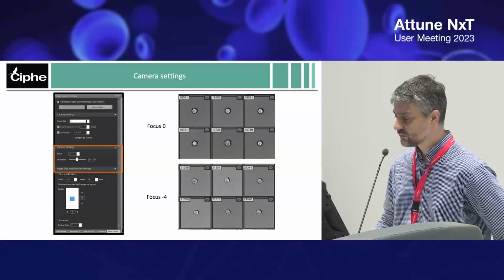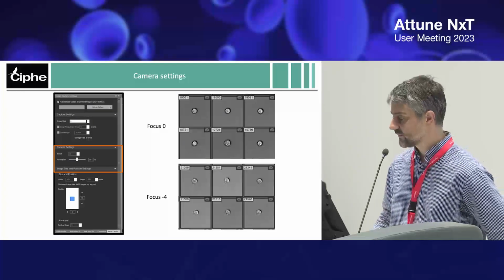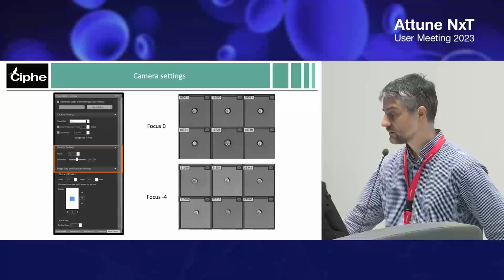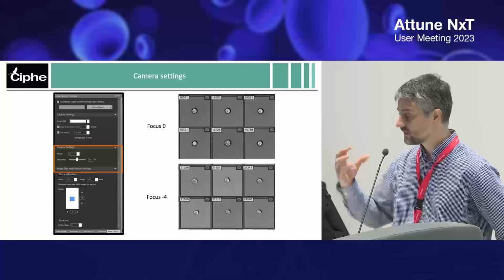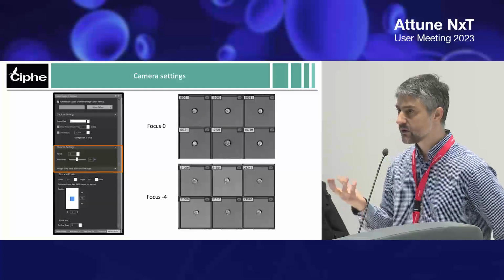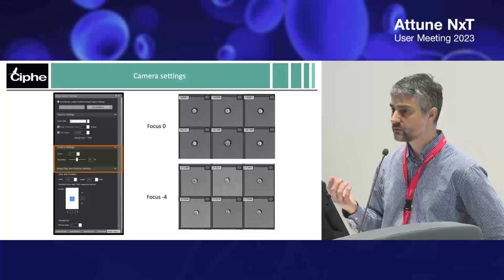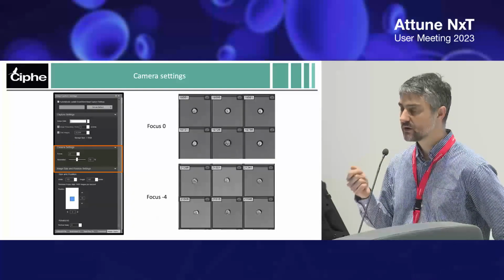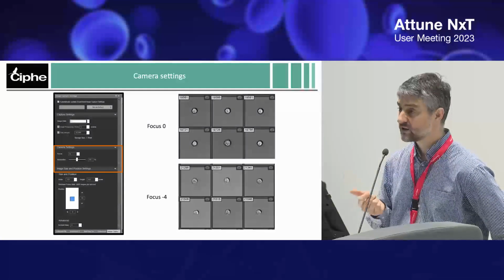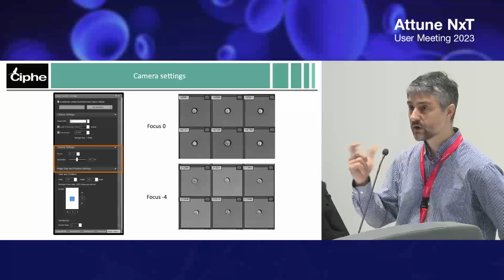So now let's talk about these camera settings. You can change the focus a bit to have things clear. And obviously, when you are a newcomer, you don't really know what you do. One of the fears could be that with automatic or semi-automated chambers, when you count, you need to make focus, and by experience, that's when people mess up the counting, right?